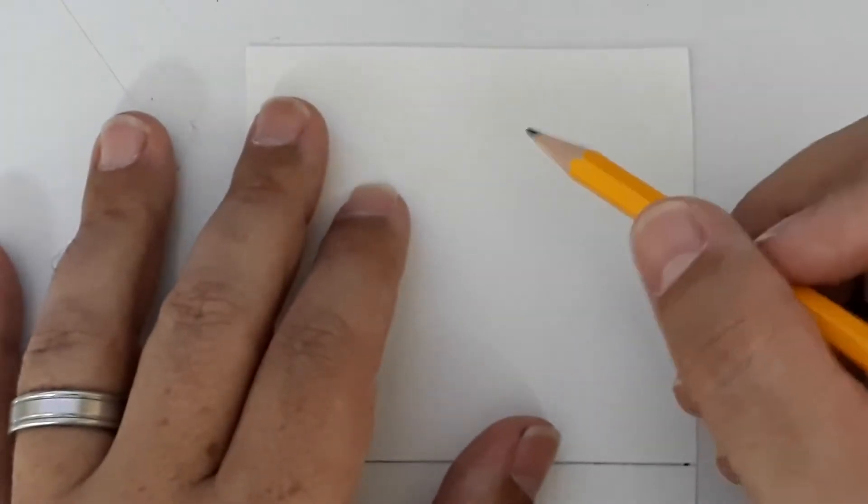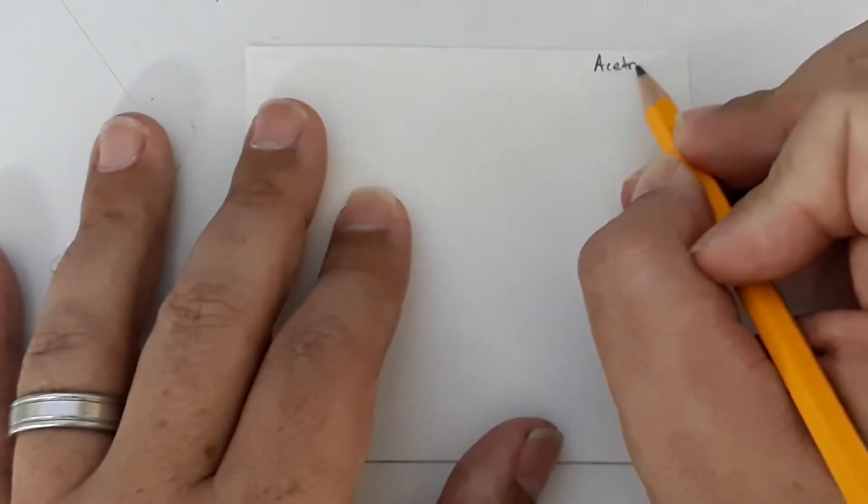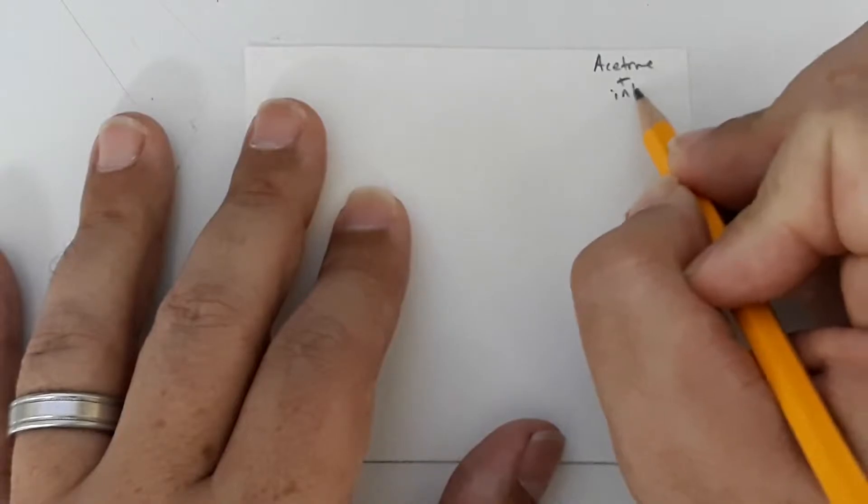Remember to always label your paper. So this one will go into my acetone mobile phase, and I'm using this for inks so I'm going to label it acetone and ink.